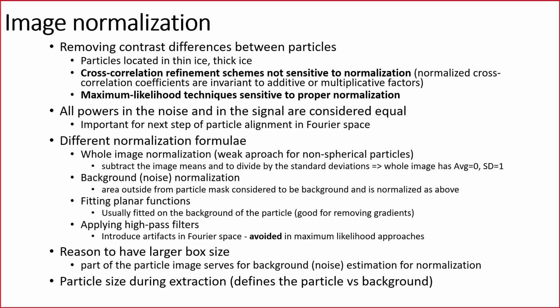However, the maximum likelihood techniques are extremely sensitive to proper normalization, and nowadays we are almost exclusively using maximum likelihood techniques for reconstruction of our particles. These maximum likelihood techniques consider that all the powers of the noise and all the powers of the signal are equal.